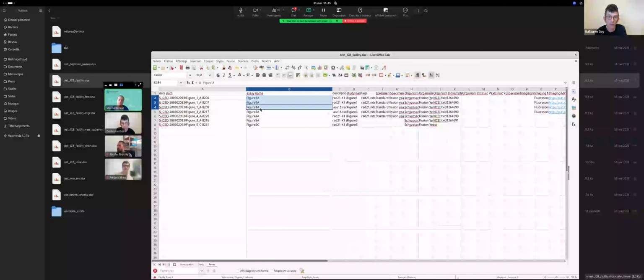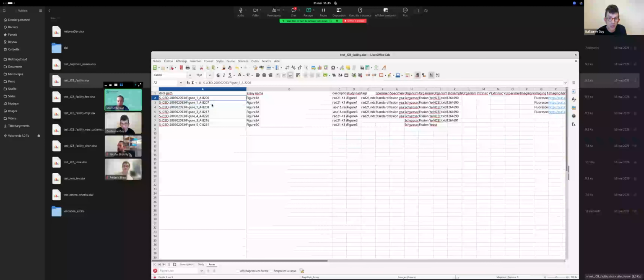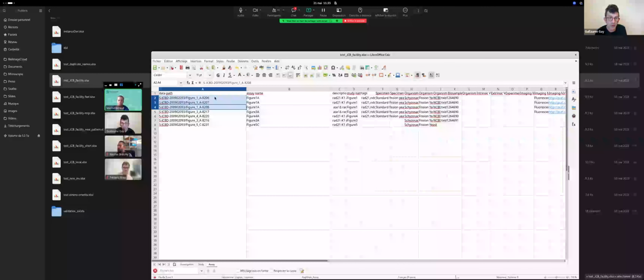And as you can see, you can have several input folders for the same assay. This might be the same sample or 3 experiments, but with exactly the same conditions, at different times, for example. They will go in the same assay, but they are not in the same directory when you import them.